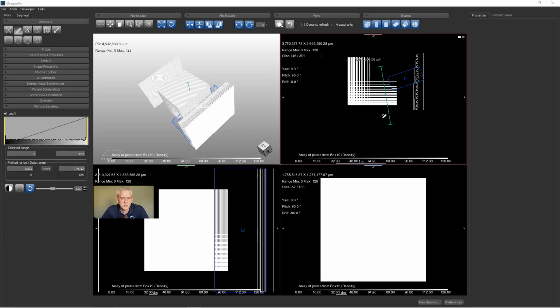Does it reduce the loss of details if you upsample an image before you regrid it with rotation? Now that's an insightful question. The answer is yes. You can upsample an image before you apply a rotation, and then you will have a more precise, higher fidelity copy of the image. You will still have interpolation, but the interpolation will now be over a smaller extent of pixels.